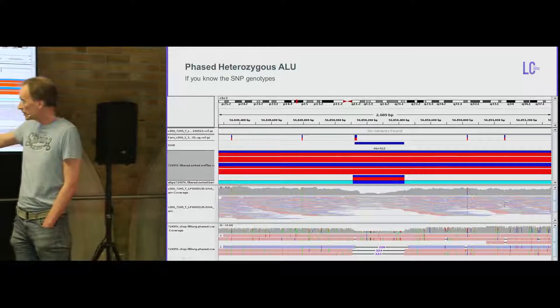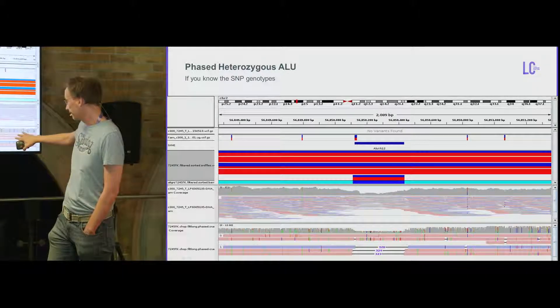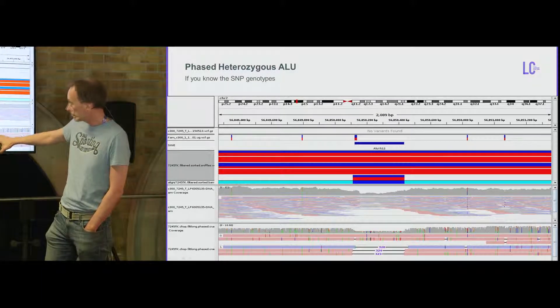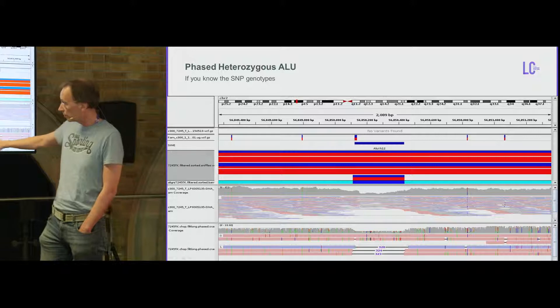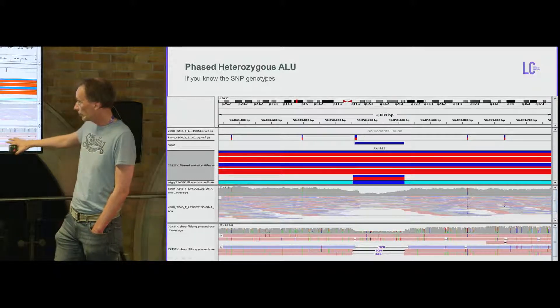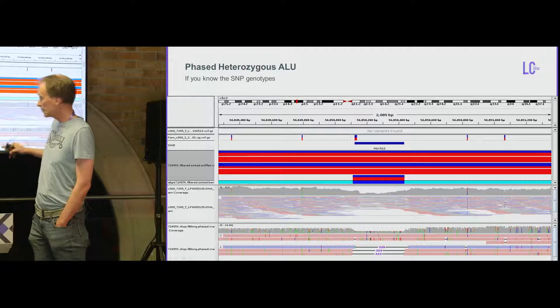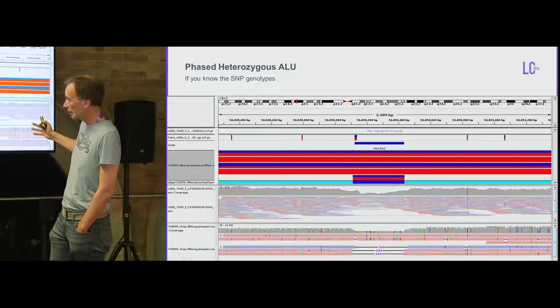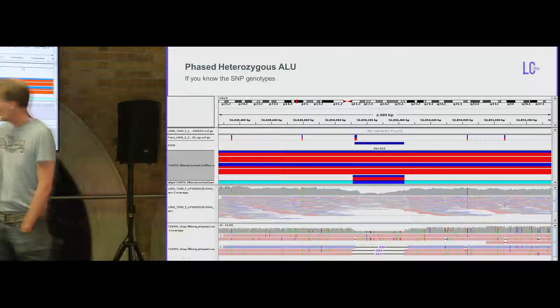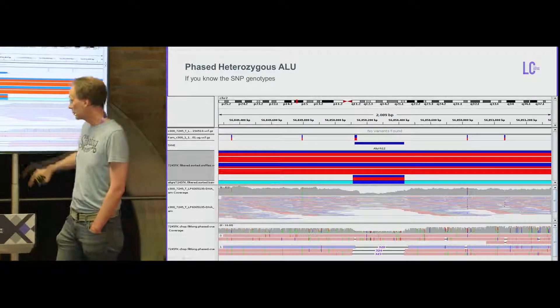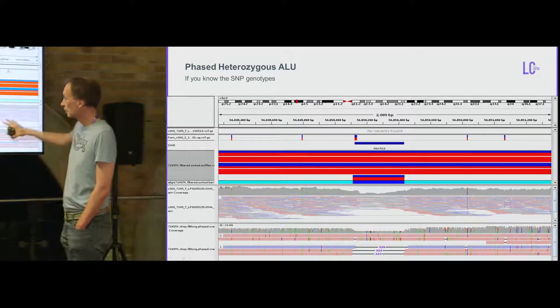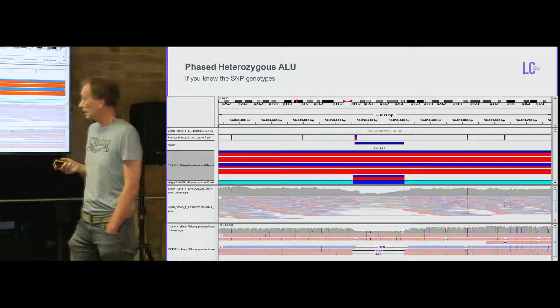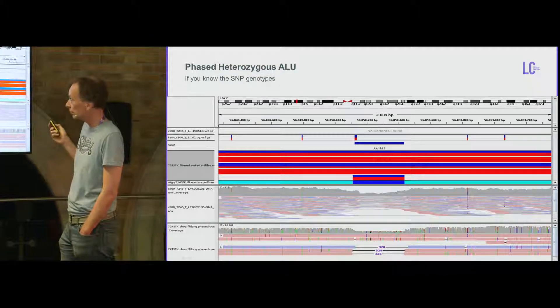This is an ALU deletion — easy to detect. This is only 5X whole genome coverage, which is not a very successful PromethION run, but you can even phase these. The reads have been phased with known SNP variants and you can see the ALU is on one chromosome. With Illumina data you might say there is a missing ALU, but it's not very clear.